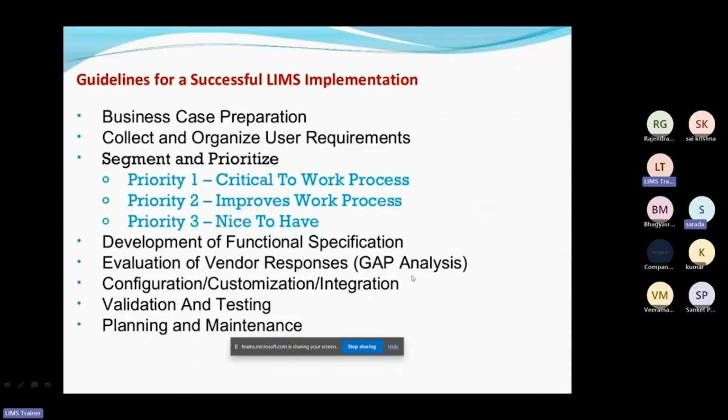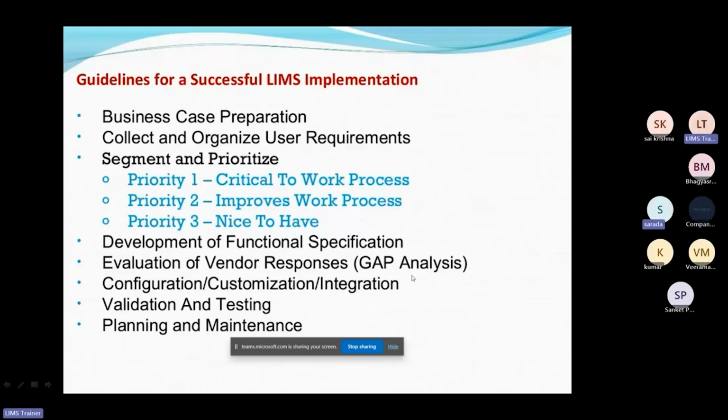See, this is just a demo. I will explain each and everything in detail in our further lectures. Here I am just giving an idea of how we proceed with the particular format. As I have explained what LIMS is and how it's helpful, now we are looking into its implementation part. We will go into all details in further lectures.